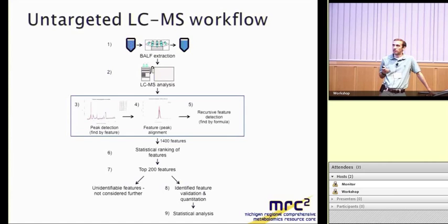Basically the same as what I've already shown, so I won't belabor much time on it. We'll talk about this part down here in somewhat more detail as we go. So I won't belabor and describe in detail the LC-MS analysis. We used a multi-platform approach, so we did our classical polar embedded reversed phase unbiased approach as a first pass and with all of the patients. And then we also did a smaller cohort of those patients just to see what we would get using hydrophilic interaction chromatography, the method I already described to you that we'd used for targeted metabolomics.